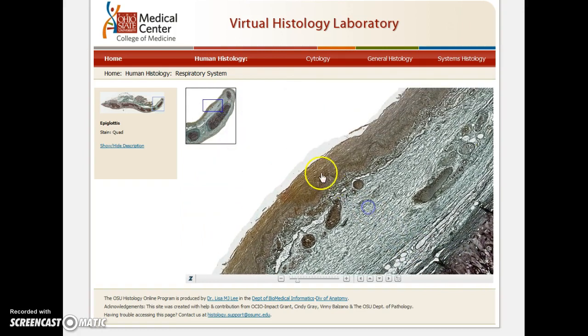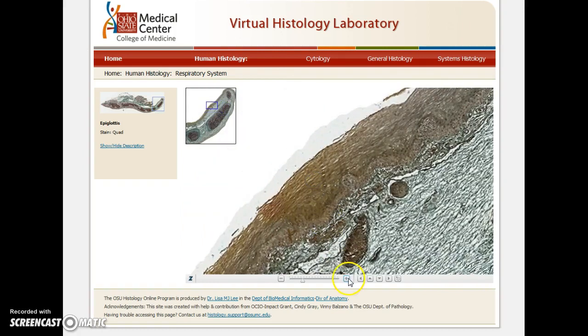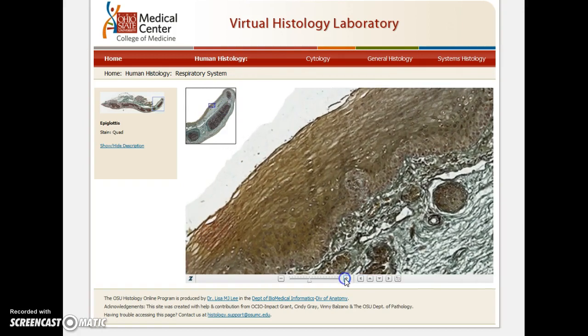So then let's look at the epithelial tissue here at the outside. So this is the first layer of cells of this epithelium, and here's the outermost layer of cells. So I can tell that I have several layers, a couple different shapes in here, but the outer layer here is flat. So I have stratified squamous epithelium here.